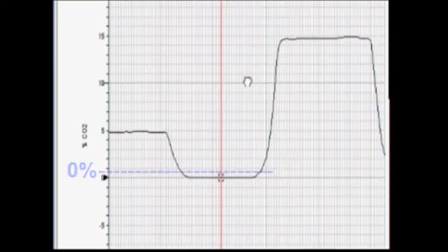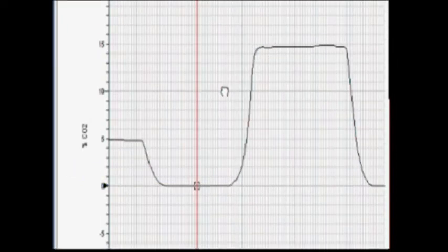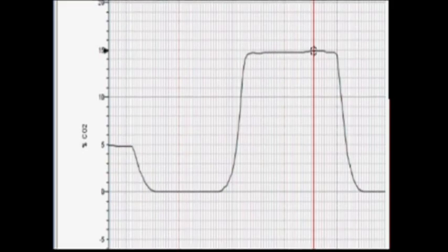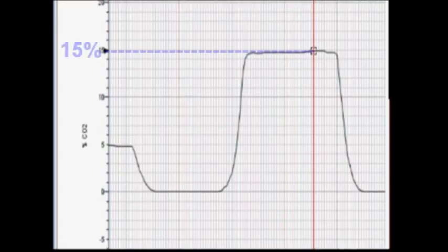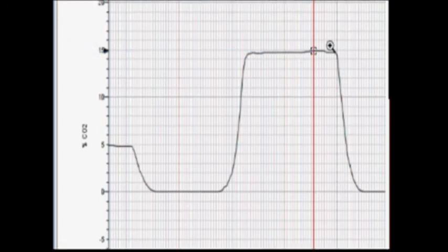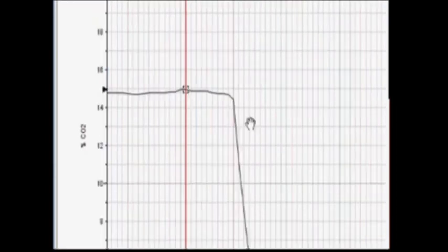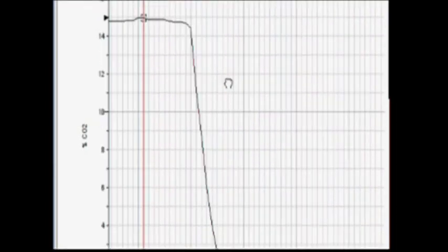And we're looking now at the trough in the readings — that was where we flowed pure nitrogen through. And the second plateau is the 15% CO2. And finally, you can see the last step where we flowed nitrogen through the analyzer to get it back down to zero.